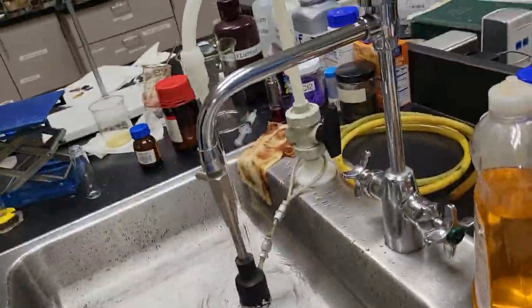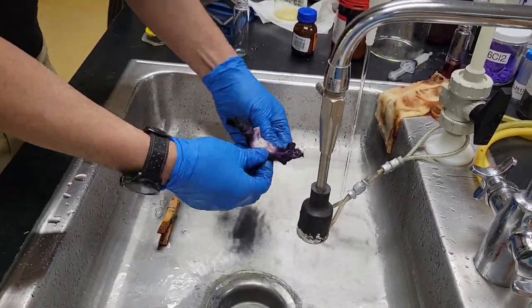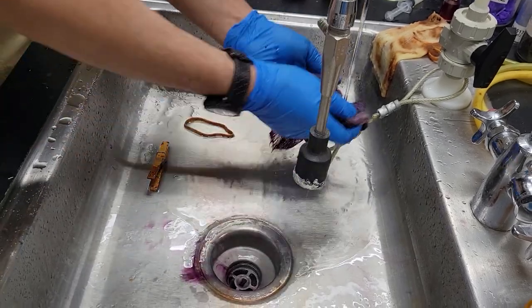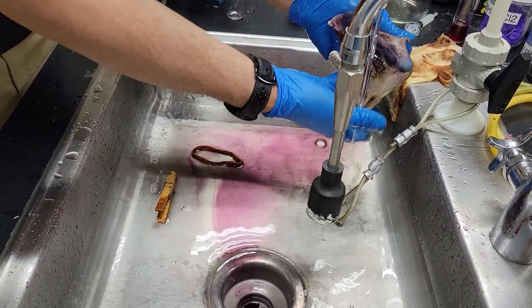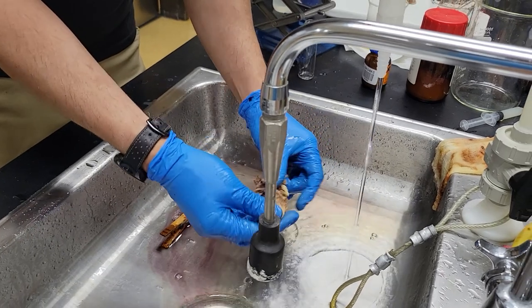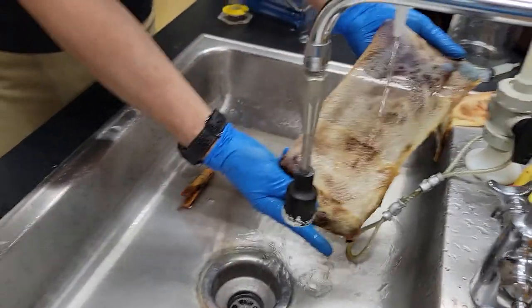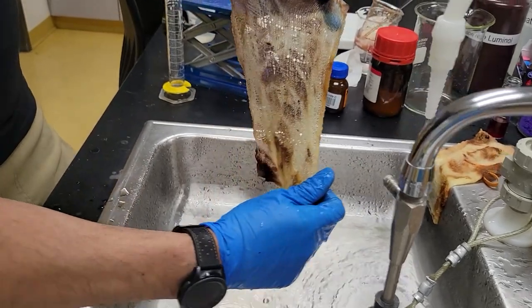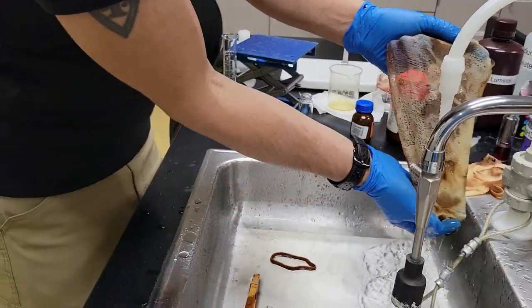Professor Ramon, yours is the purple one. Oh, nice purple — soak it really good and squeeze it really well. Nice little purple color — looks like permanganate, but it's not, it's a synthetic dye. I wonder if the resorcinol gives us that brown-yellow. The naphthol does that too — it looks kind of brown now, it didn't retain all the purple color. But look at the pattern he created up here — it almost made a butterfly-like pattern. Is it like a palm tree maybe? I see trees and faces — they're learning our psyche now, they're going to analyze this video.